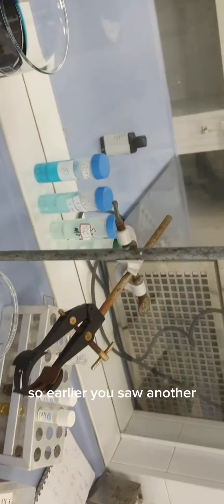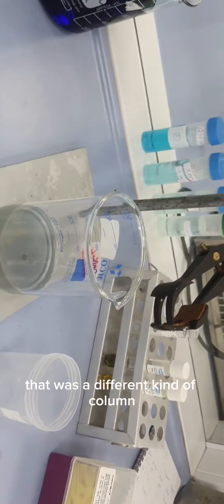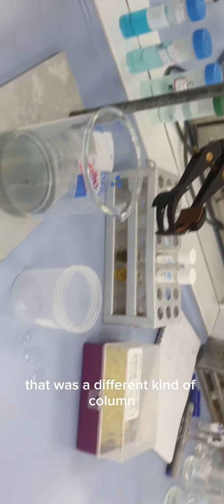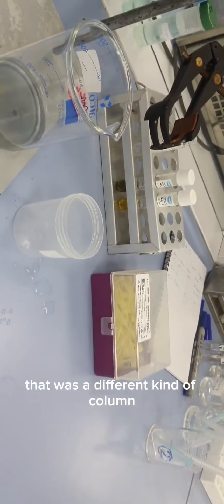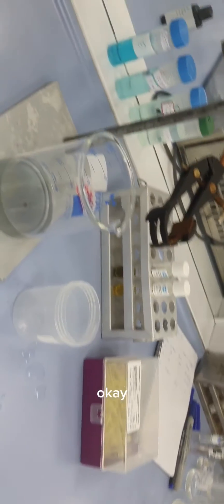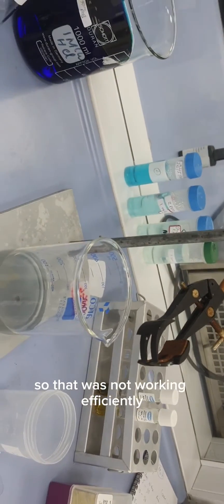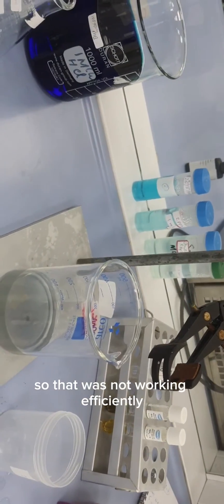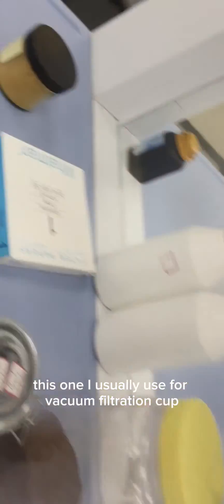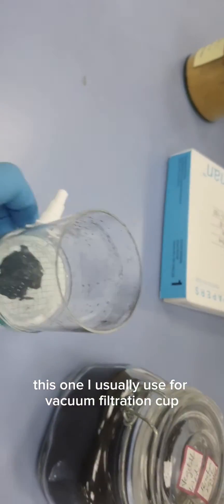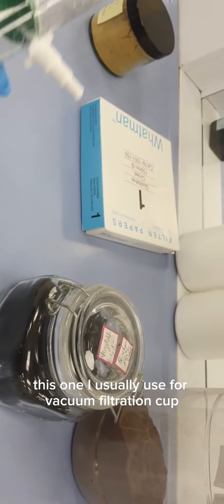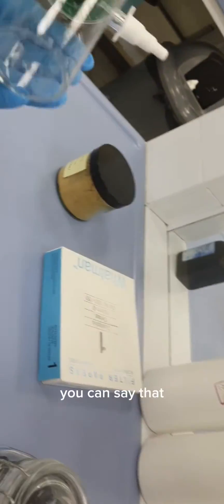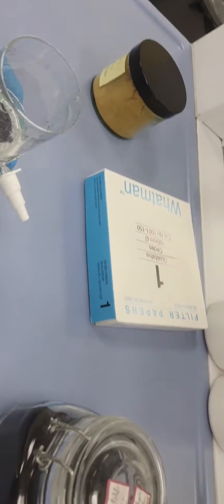So earlier you saw a different kind of column that was not working efficiently. This one I usually use for vacuum filtration. What I will do is this one here, you will get the clear water.